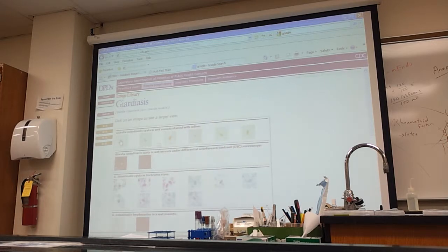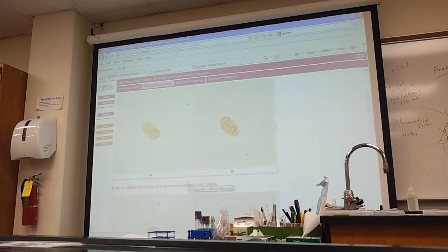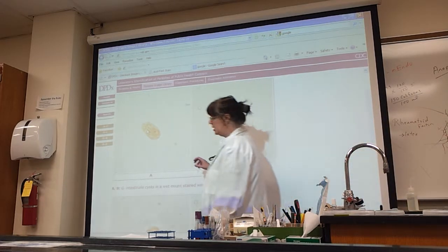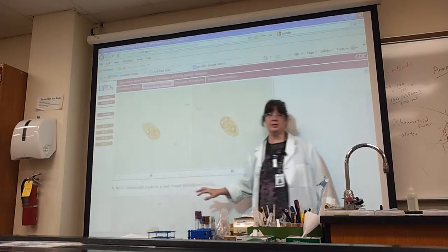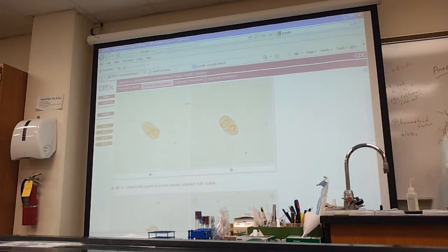And here we go, Giardia. This one's really funny. Yes, it has the 2 eyeballs looking at you. He has extra, he's got a nose and a mouth, but you probably won't see that. You can probably see the eyeballs. The nose and mouth are too small to see, and there are multiple flagella right here. Flagella right here. That's Giardia.